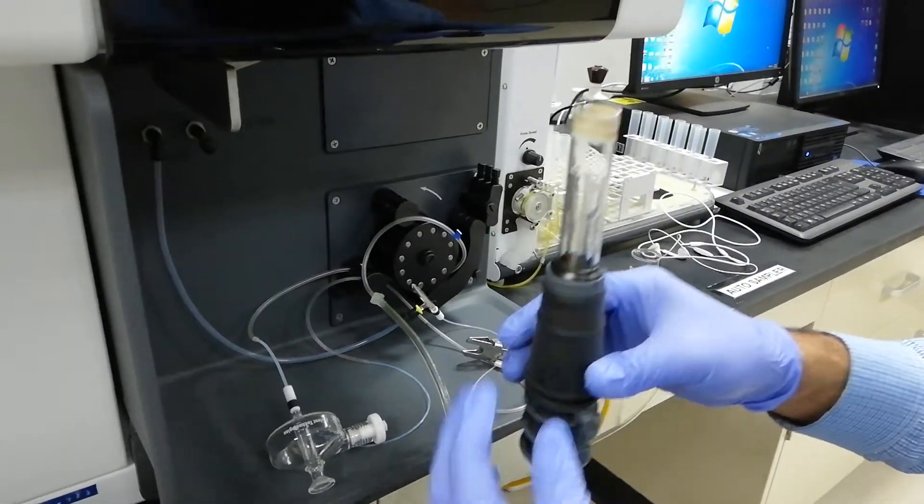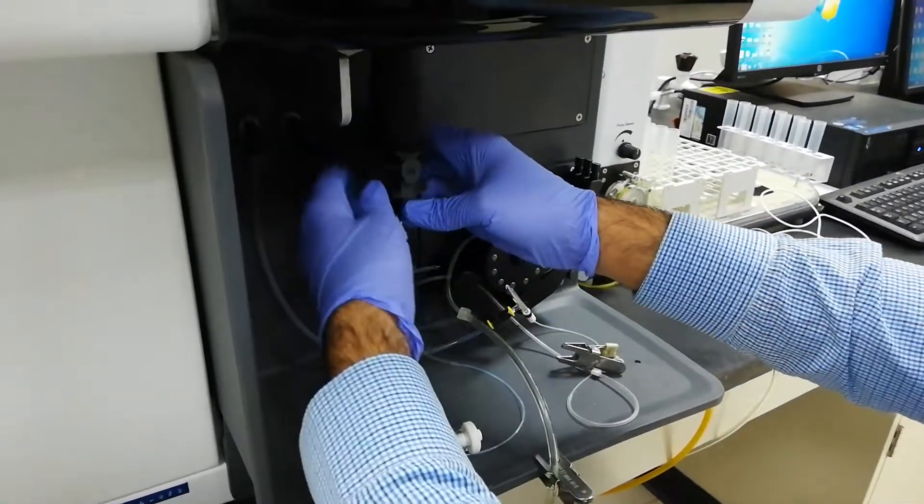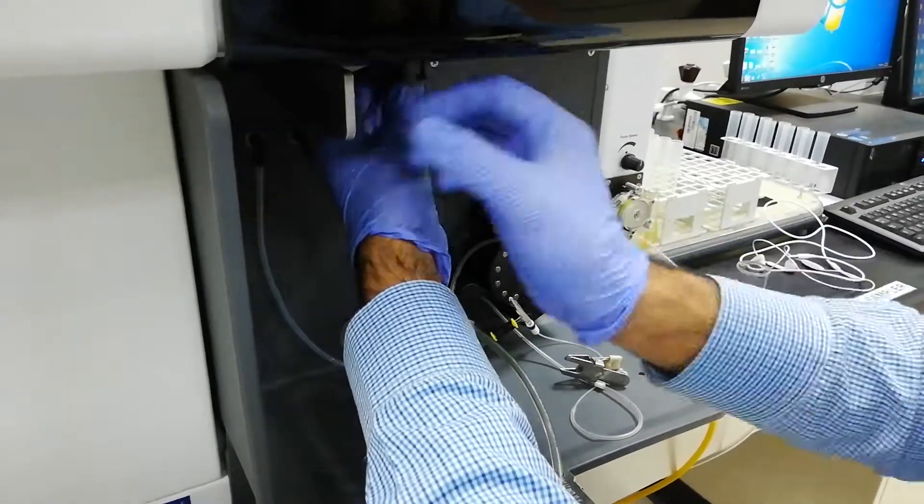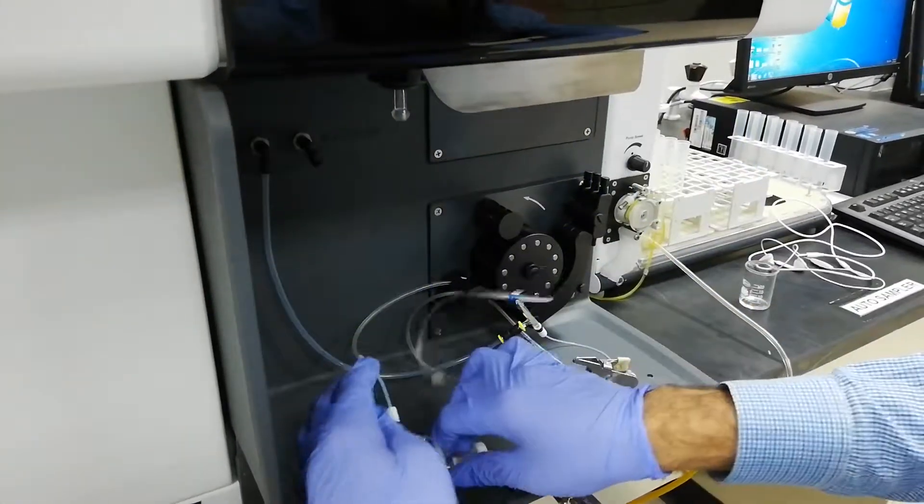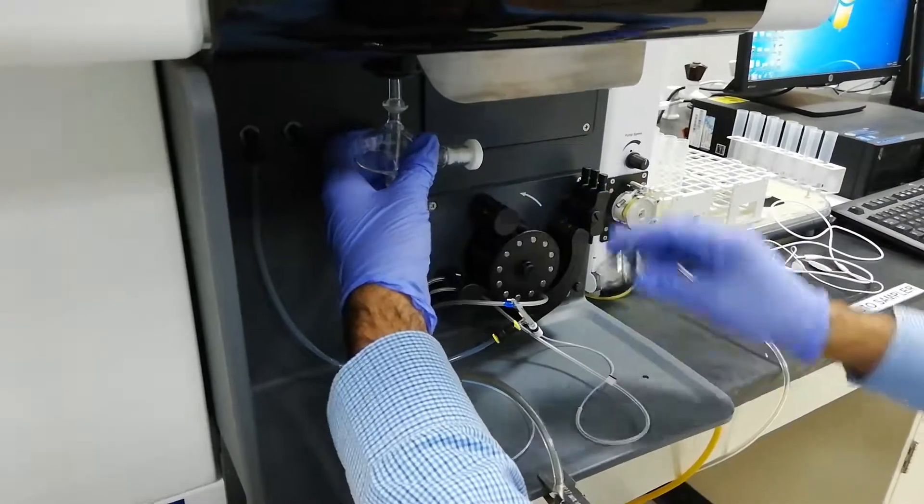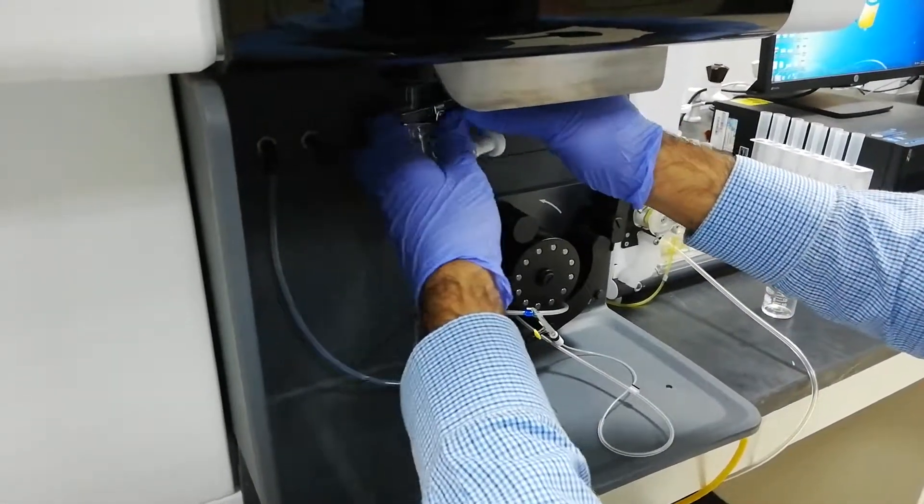So now, in front of you, I will install the torch. Here, you can install the torch, then close it, then put the spray chamber like this, tighten the screw.